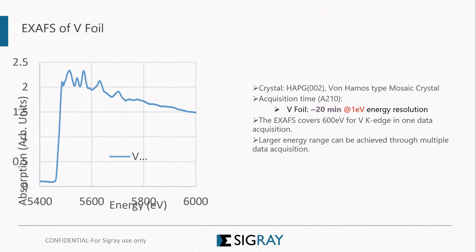And I think the production system is almost ready. A lot of measurements were done with our prototype system, the alpha system, and our beta system is being commissioned and could be ready in about months. So that one can measure from 2 keV up to 12 keV or so.